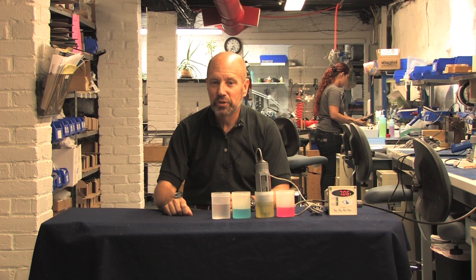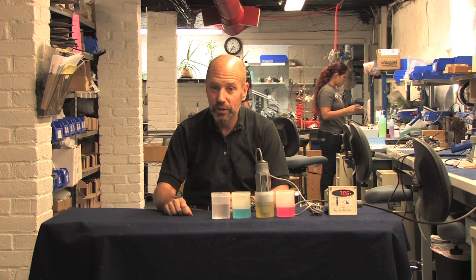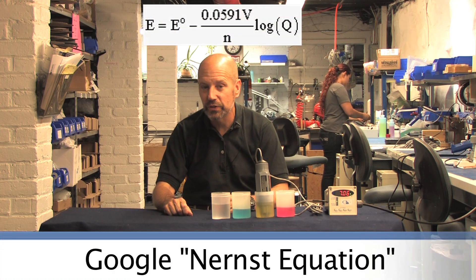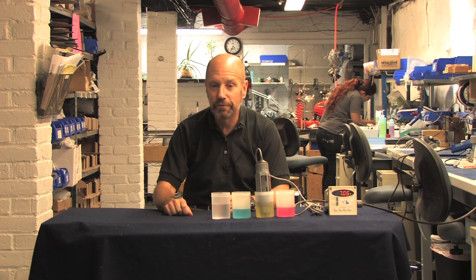Want to look like an expert? Just remember that number — 59 millivolts per unit change in pH. If you're so inclined, you can learn how that number came to be by going to Google and looking up the Nernst equation. You also see that 59 millivolts for an ORP probe for the same reason. The Nernst equation also tells you how voltage changes when the temperature changes.